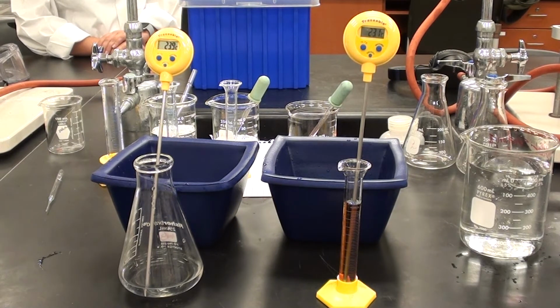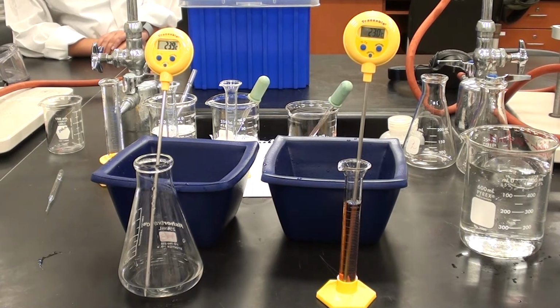So what we're looking at here is a situation where we're trying to get these both to around about 14 or 15 degrees. It doesn't really matter exactly what you get them to as long as you know what you're getting them to. We're going to get both of these down to that same temperature before we add them together, and then we'll maintain them at that temperature throughout the reaction so that we can have a constant temperature during that time.